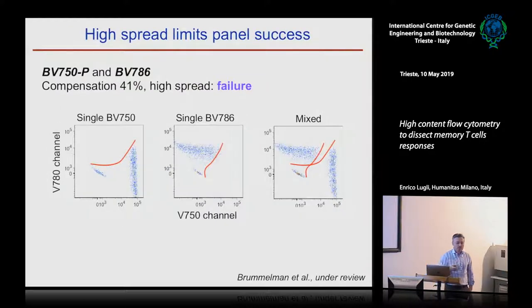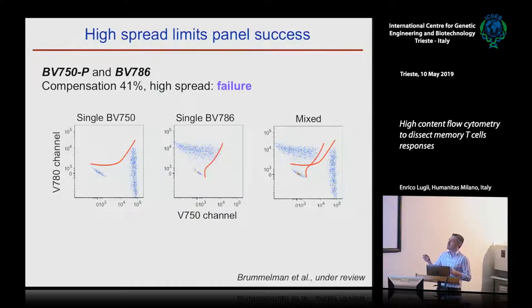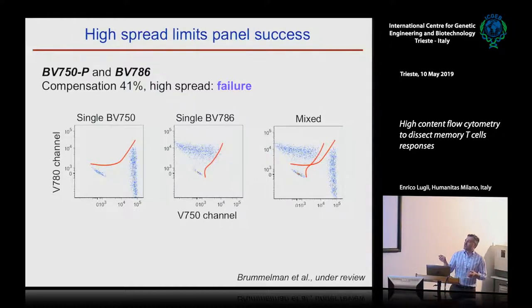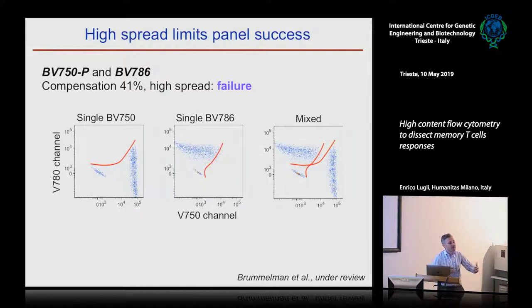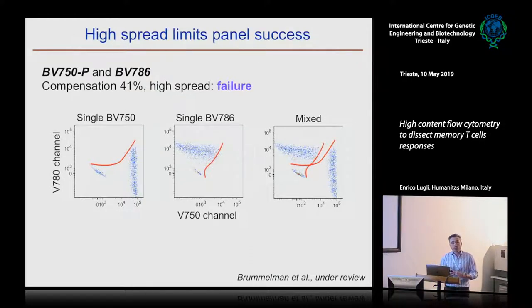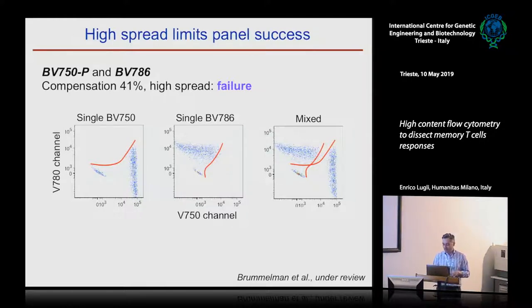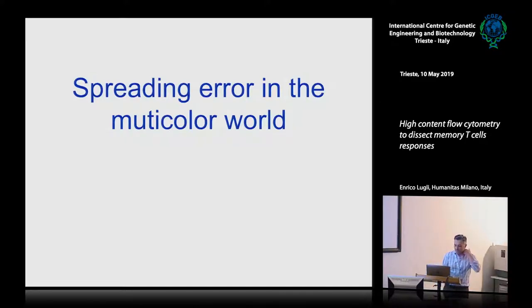Here's another example using BV750P and BV786. In this case, the compensation is only 41% — you would say that's fine. But look: you stain for a single BV750P, and a single BV786. When you compensate, the spread in the data is so high that you can't really distinguish the double positive population when you mix them together. So even though the compensation is low, the spread is so high that you cannot separate. It's not important how much you compensate — what's important is the spread in the data. So we're talking about spreading error in a multicolor world.